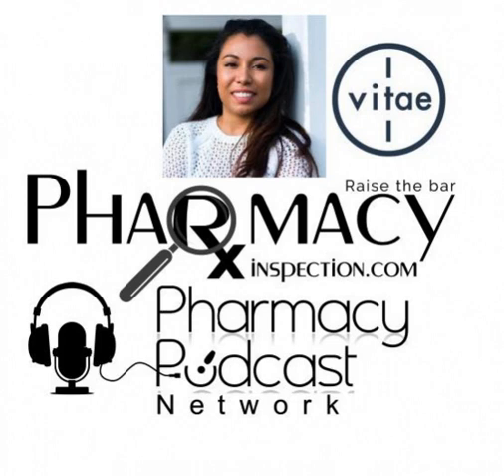Absolutely, and we're also joined with Daniel from Vitae, so I'm going to let him step in, introduce himself, and tell us a little bit about his role and some of the technology from his perspective as well. Thanks for that intro there. This is Daniel, and we've developed a 3D printing platform which allows a pharmacist to more easily produce a wide variety of dosage forms ranging from gummies to troches, suppositories, all on one machine.